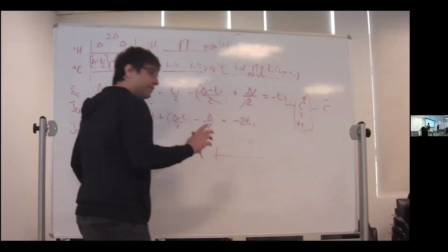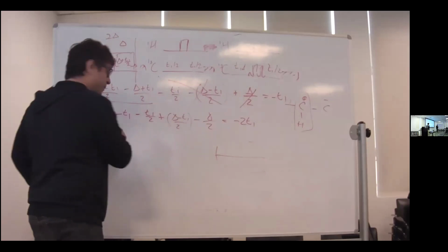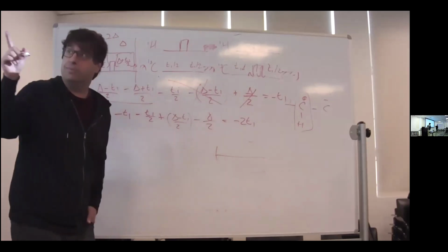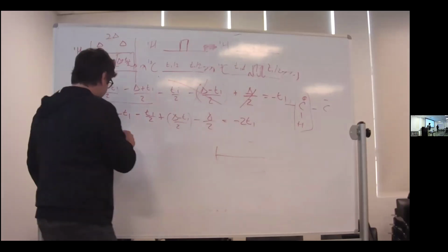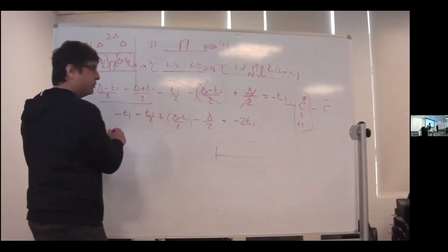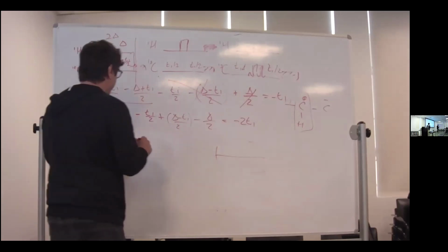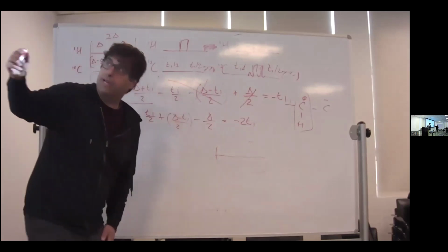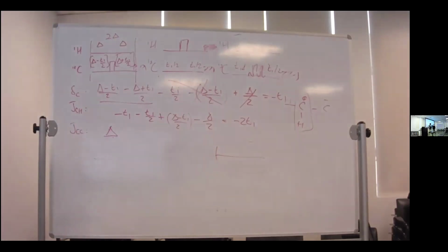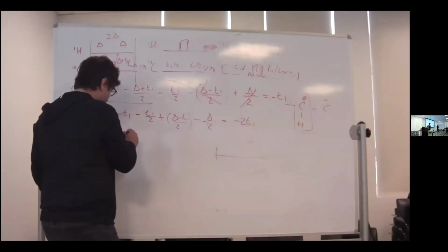Okay, let's do carbon-carbon addition. I don't know what I'm supposed to write. And those are hard 180s on the carbon. Start from delta. Yeah, remember, we started with two delta. Oh, delta, sorry, delta, because it's one delta. Then let's start for the second half. So we had this hard 180, so we're in the minus. No, it's a hard. So it's all positive. All positive, still positive. Yes. Plus T1 over 2.